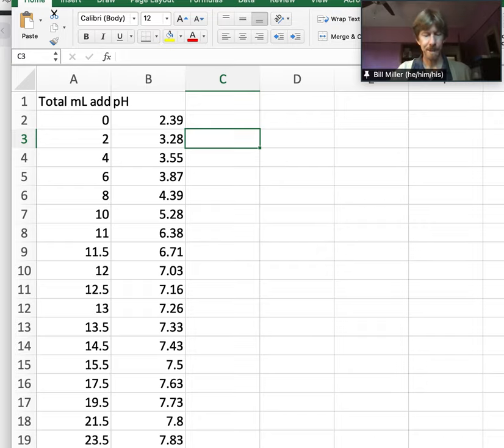So I just did my first titration. I've put those things aside, taken off my goggles, and now I'm going to graph it. I'm calculating concentration of unknown acids by graphing using Excel.